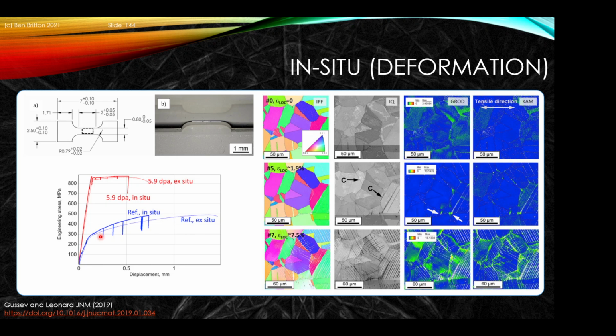And at each point, for different amounts of total strain, they can see in this example the material is starting to do deformation twinning, and you can see also the increase in misorientation spreads and kernel average misorientation, specifically noticing it happens towards the interfaces of different microstructural features.